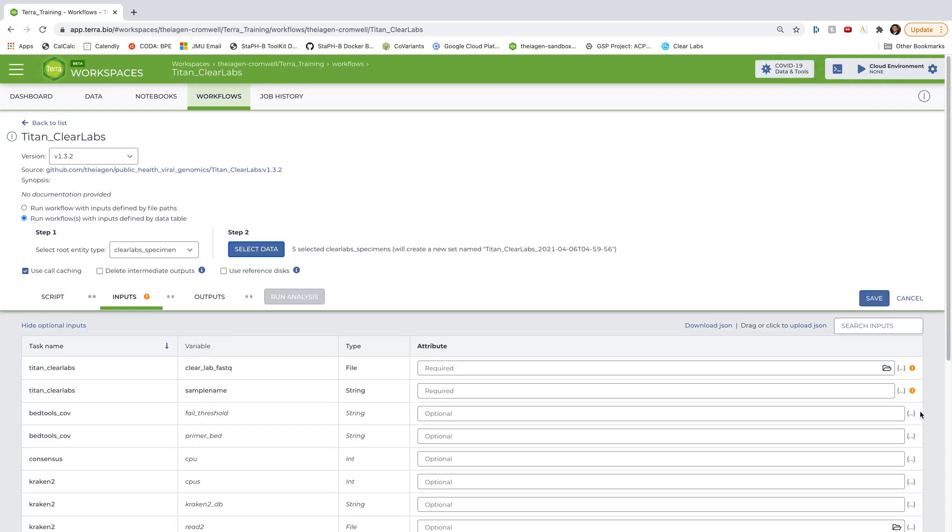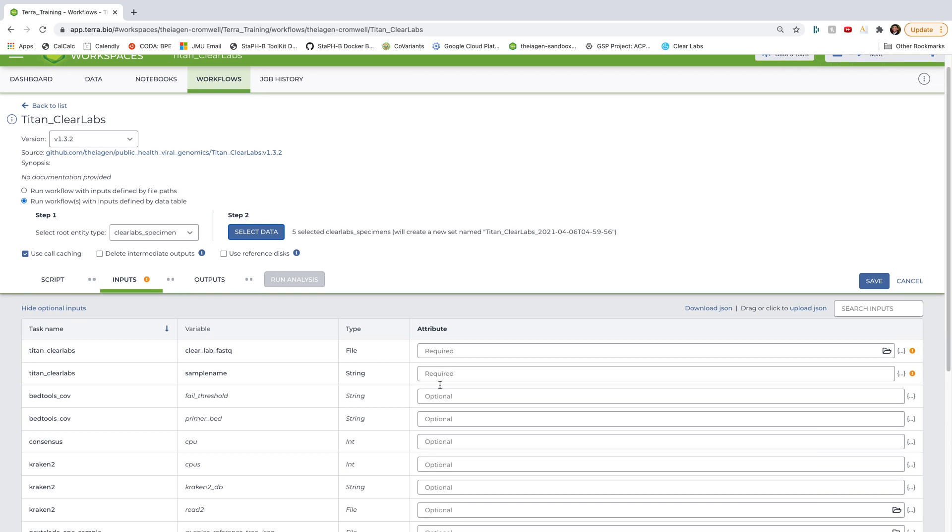OK, now that I've selected which samples to analyze, I need to further define which elements of those samples should be fed in as inputs to the Titan Clear Labs workflow. And the required inputs are these two that say required up here at the top. And that's the Clear Lab fast queue data and the sample name for each sample. And everything else under here are optional parameters.